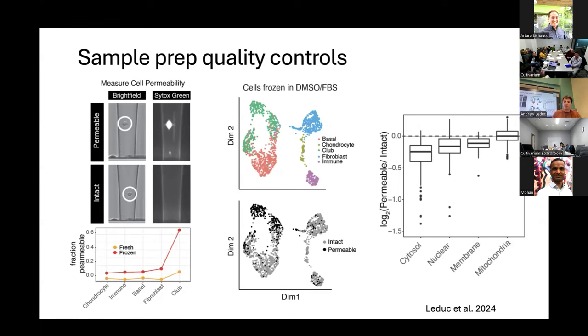But obviously the difference between proteomics and RNA-seq is that our mass spec time is a bit more valuable. And so it's good to be able to exclude these things. Sorry, some of these slides were assuming that people hadn't seen the sample prep yet as well.